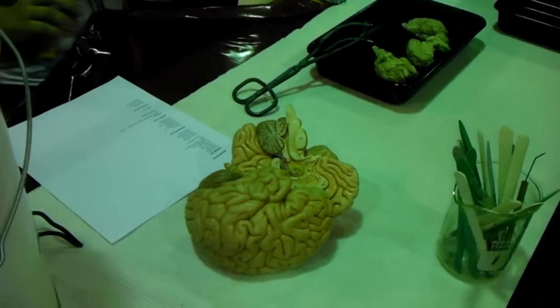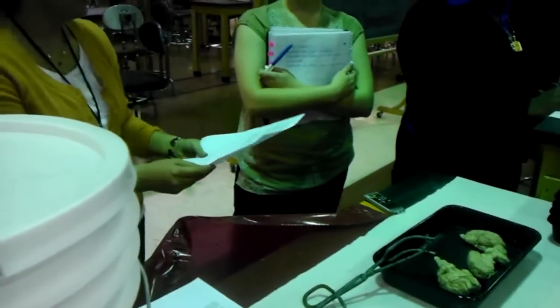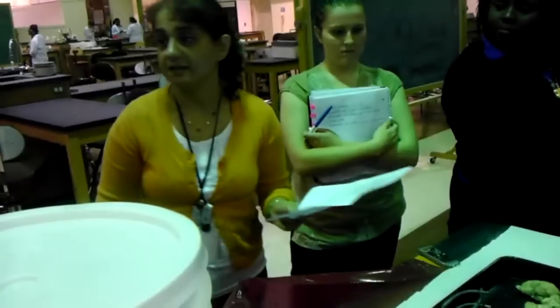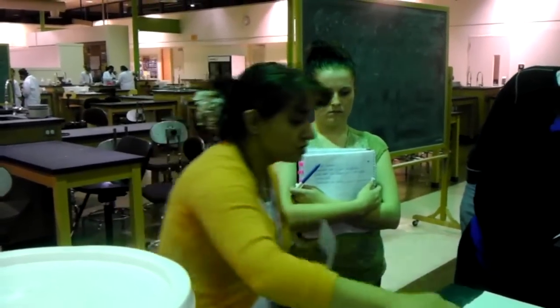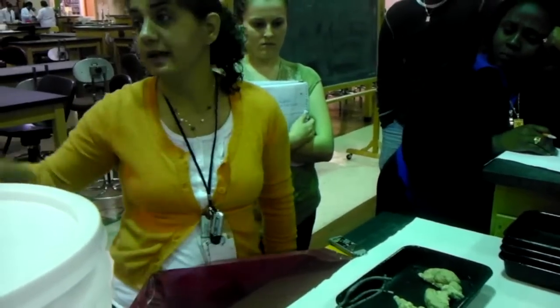But we have another handout here for the sheep brain dissection. So again, here it tells you which parts you are responsible for in the whole sheep brain and in the dissected sheep brain. So it means that in the test, guys, you will have the sheep brains like this, and I'm going to put the pins with numbers on the different parts and ask you about the name of it.